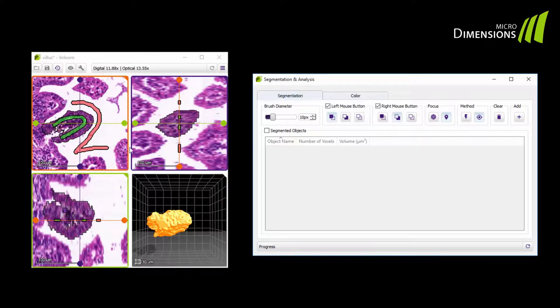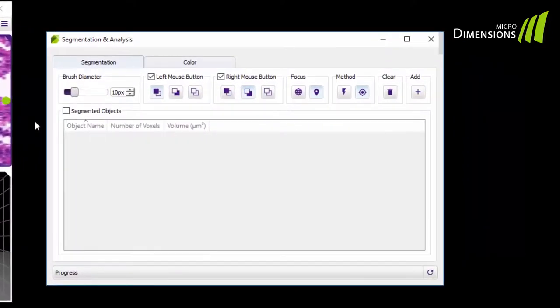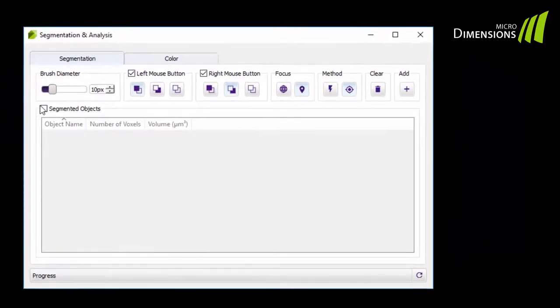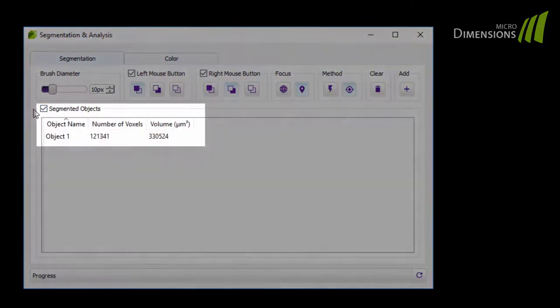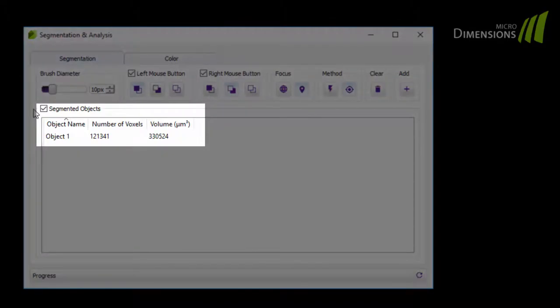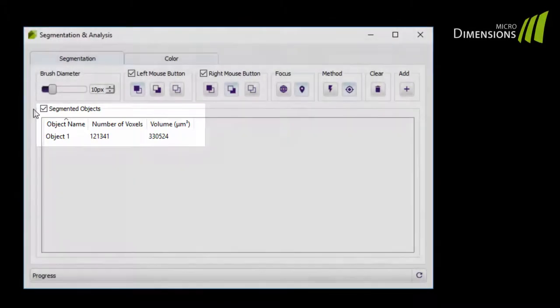To analyze the segmented object, just tick the checkbox. In the analysis window you will see the results, the number of objects, and the volume in cubic micrometers.